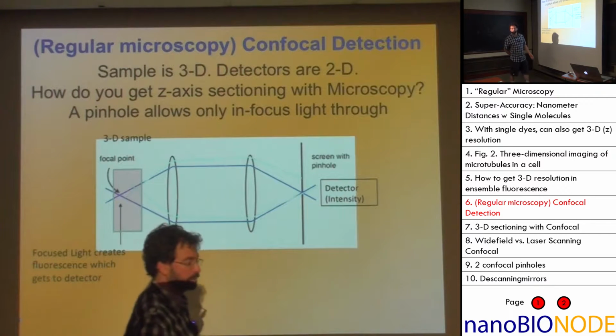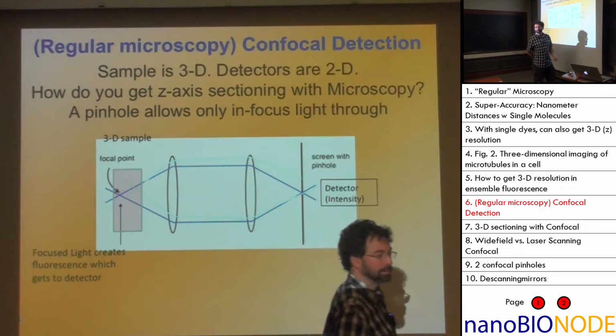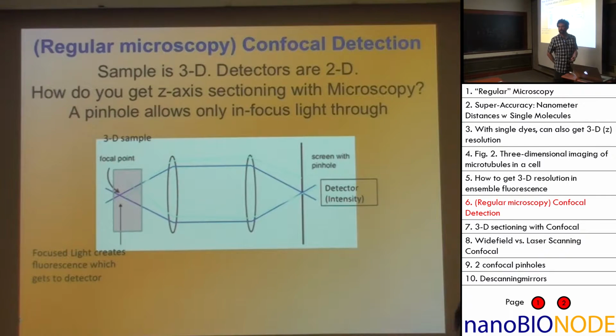Basically what you do is you have to test it. It depends on what you're using. You test it with your various different pinhole sizes. You test it with various amounts of laser power hitting it, and it's really a heuristic sort of thing.